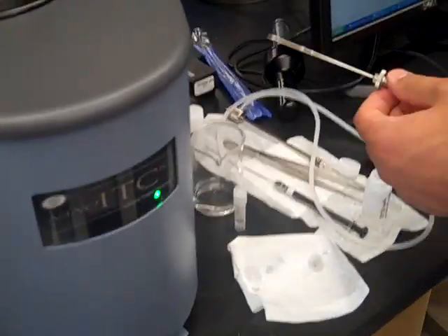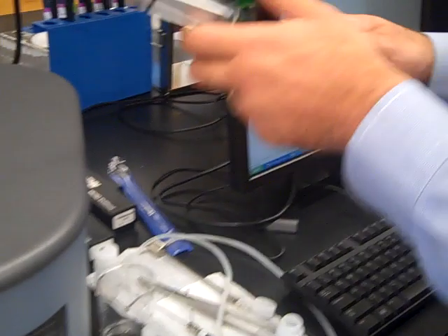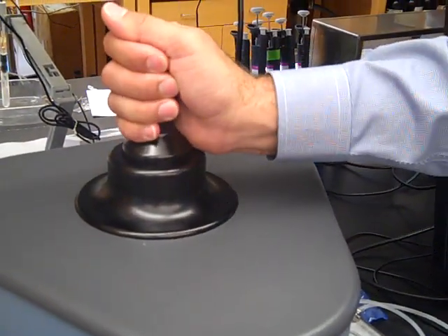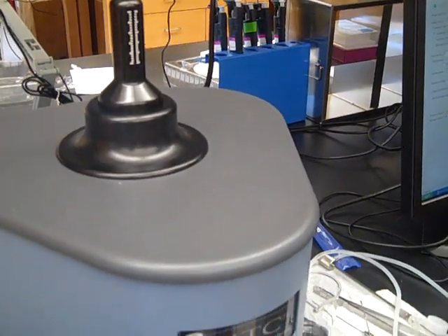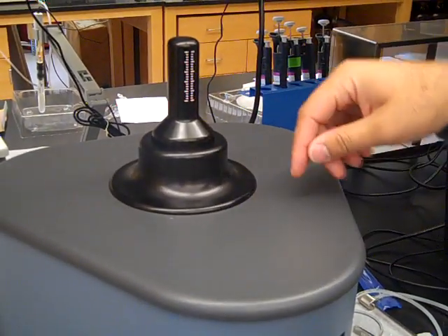Go ahead. Okay, yeah. So now I'm just going to rinse out the syringe, but since we finished cleaning, I want to put the burette handle back on the instrument. You don't have to put the syringe in there, but you want to keep the burette handle in there, A, to maintain the temperature if you want to do another experiment, and also so you don't want something dropping in from above into the instrument.